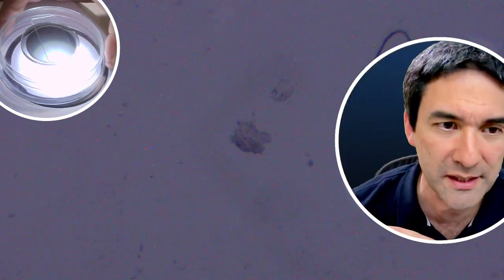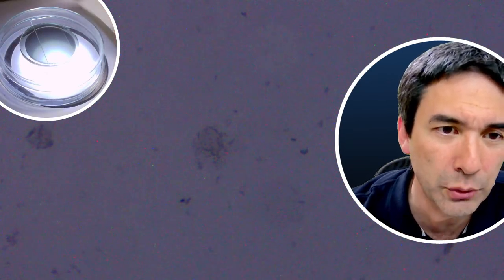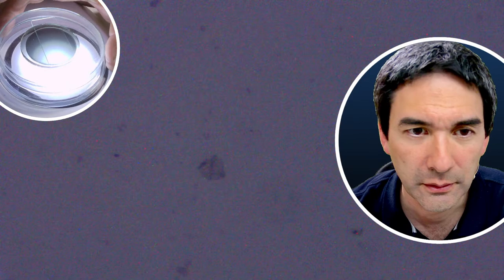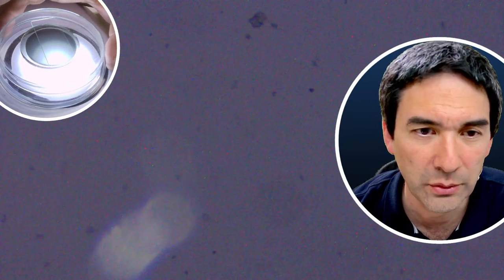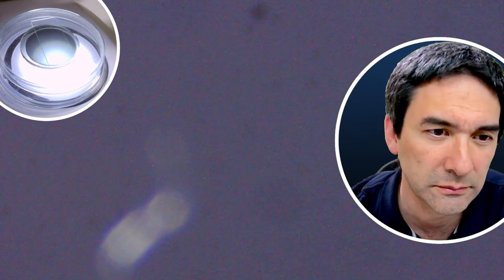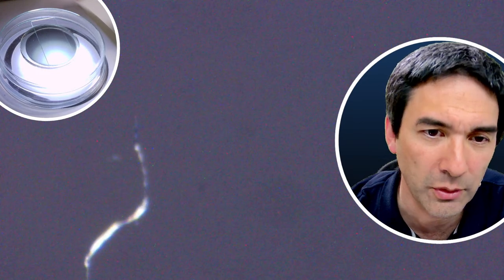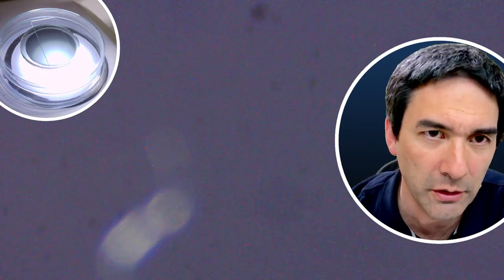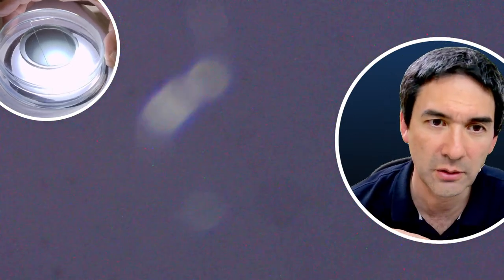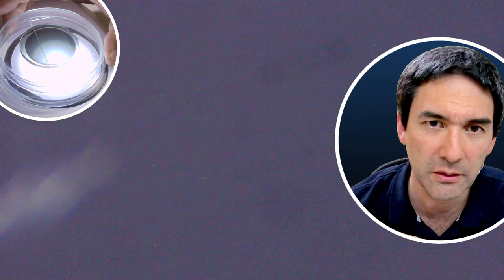If they were polarizing, see, these might be some of them here, then they should actually properly shine up brightly. So no, I think we can exclude this. What is this here, this bright thing here? It's on a different plane. That's a dust fiber or a textile fiber. So in short, to answer your question, human skin cells or cheek cells or epithelial cells, they don't give me this effect. I mean, look here, maybe again, those gray dark spots that you see.